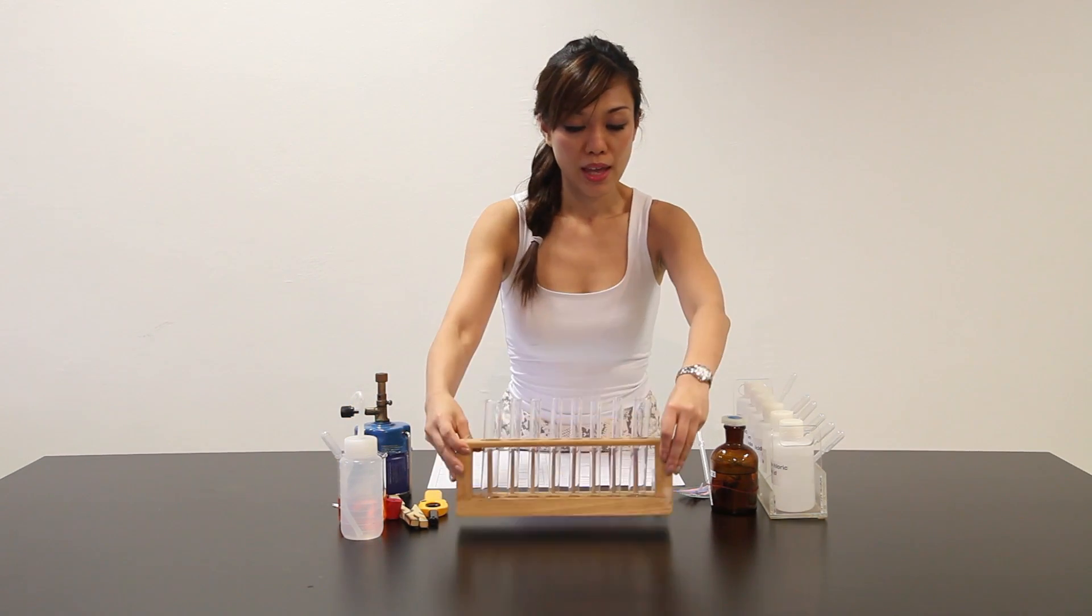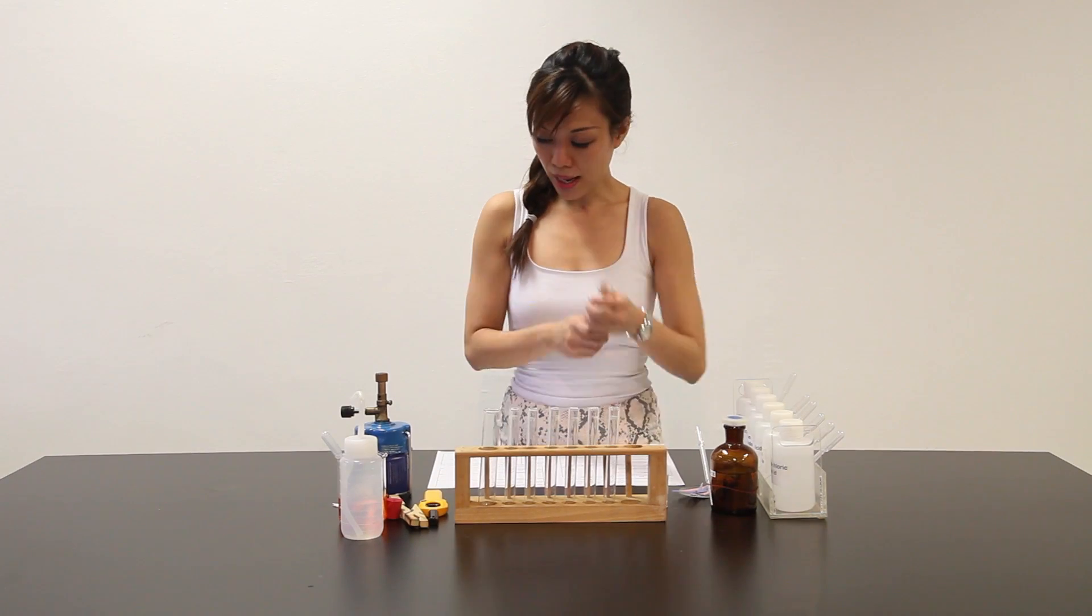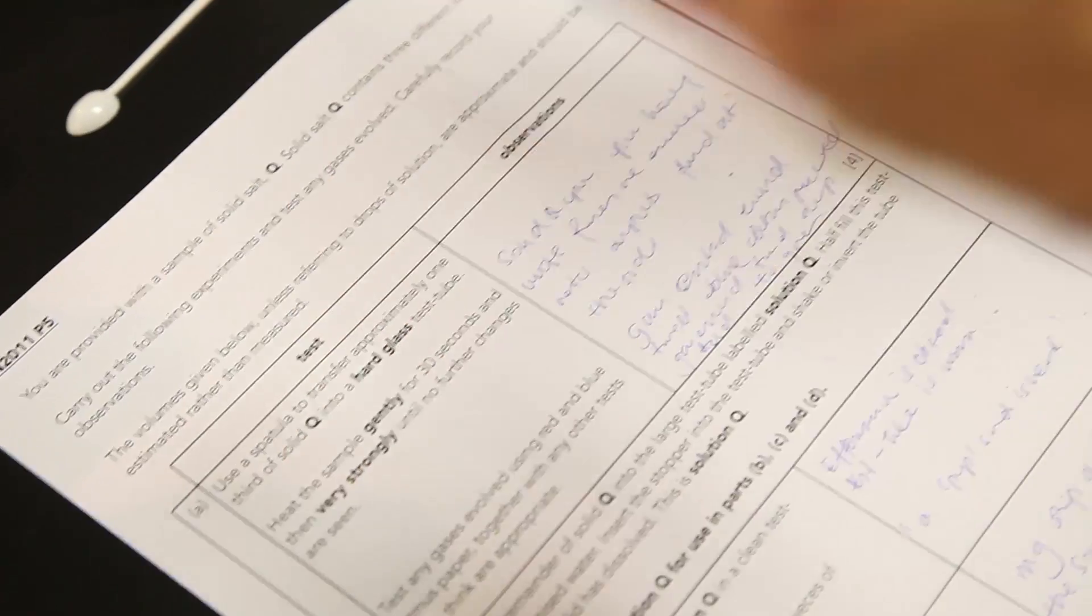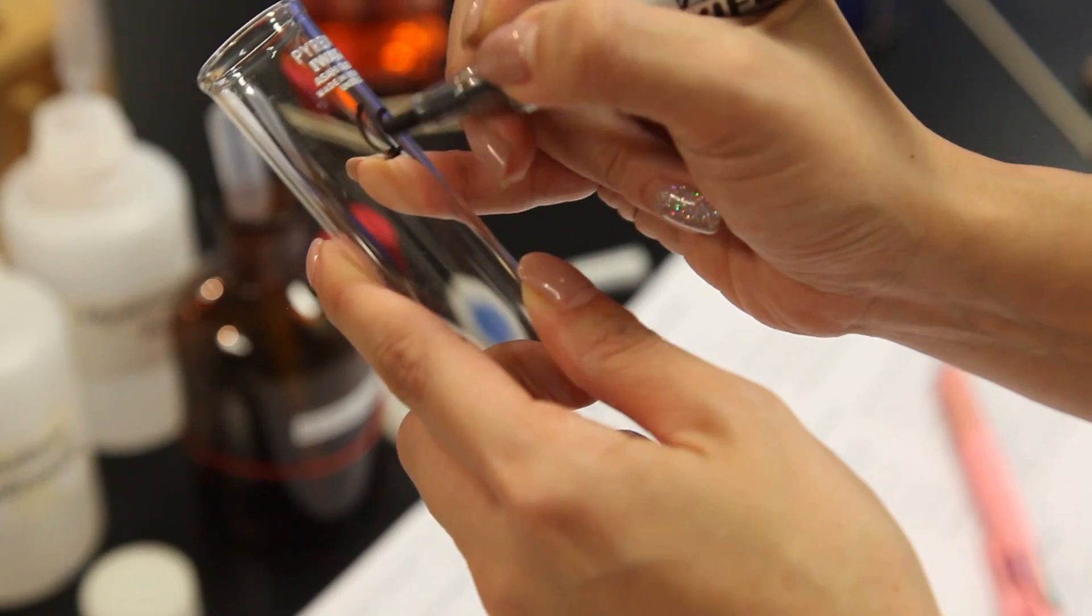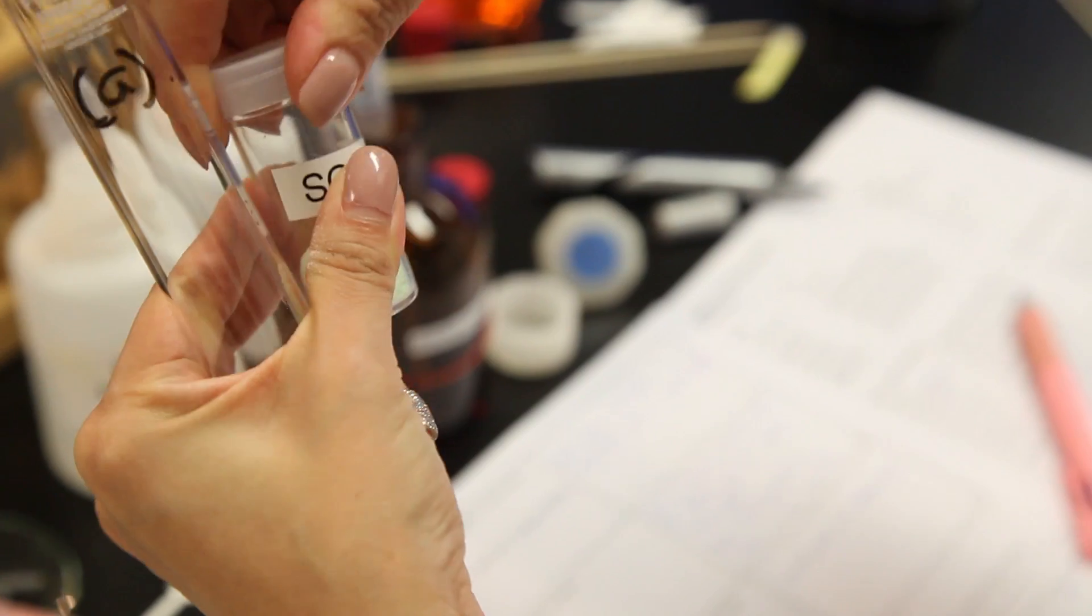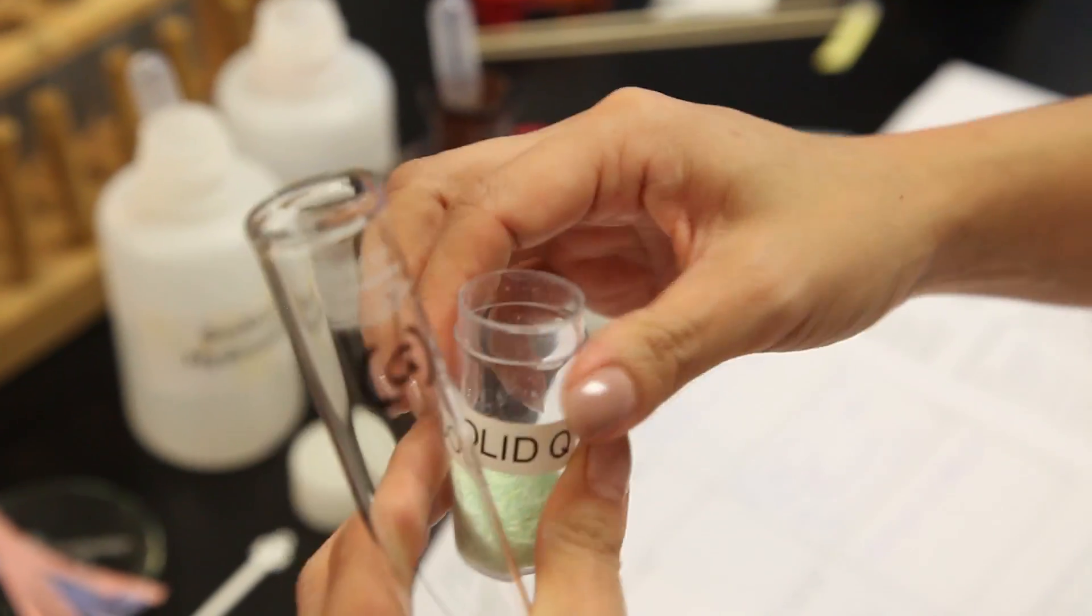So first of all, let me put the test tube in front and let's start doing the marking. Test tube. This is a hard glass test tube. Let me label it as A.